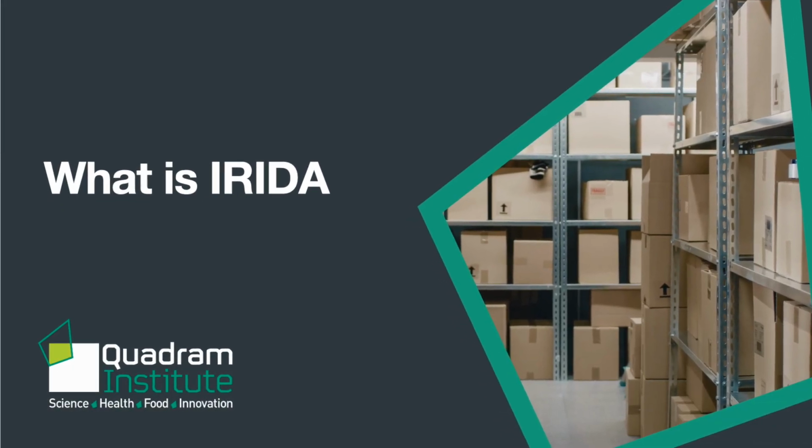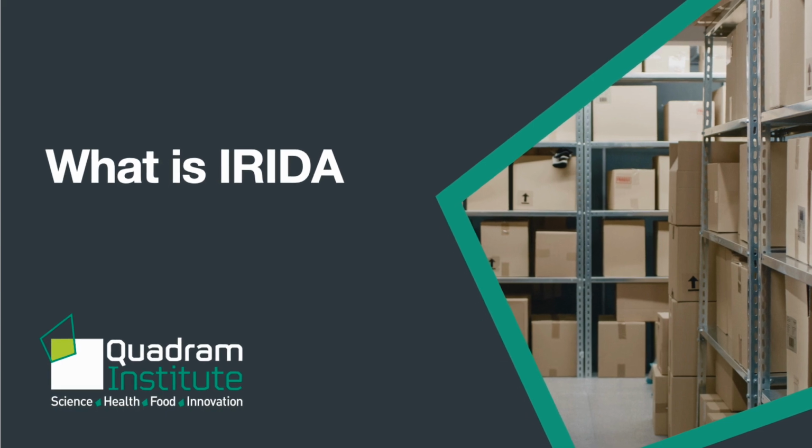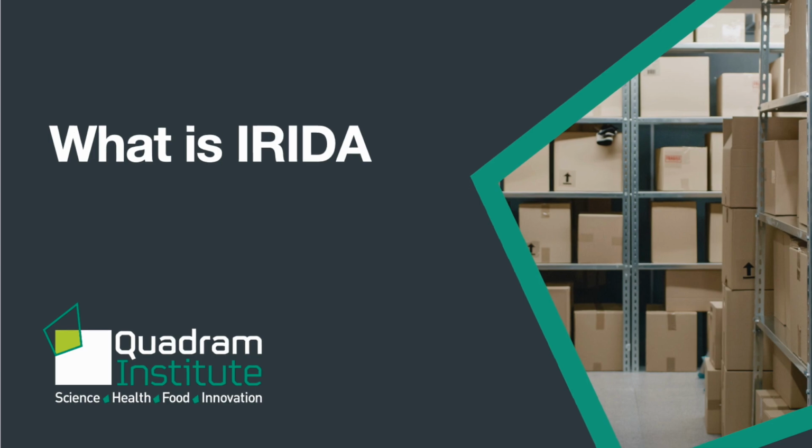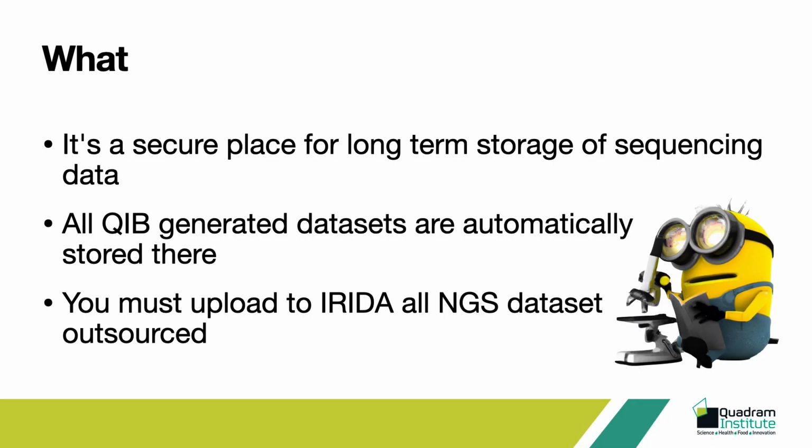So what is IRIDA? At its core, IRIDA is a comprehensive web-based platform that enables the long-term storage of sequencing reads in a well-organized repository. It allows you to securely store and manage your sequencing data, ensuring it remains accessible and easily retrievable whenever you need it. With IRIDA, you can store your reads, associated metadata, and even perform various analyses within the platform. It is designed and implemented to provide a safe space with highly redundant storage, compliant with the requirements for data storage of our funding agencies.